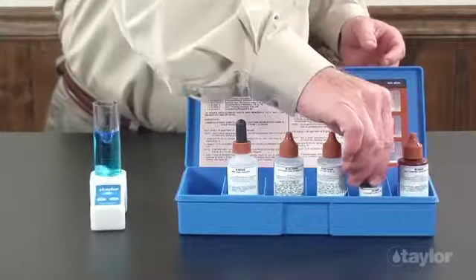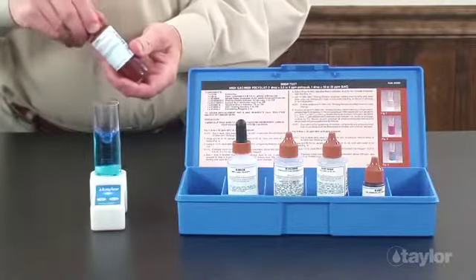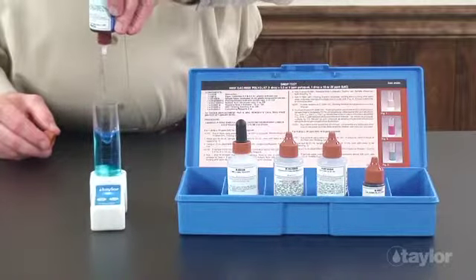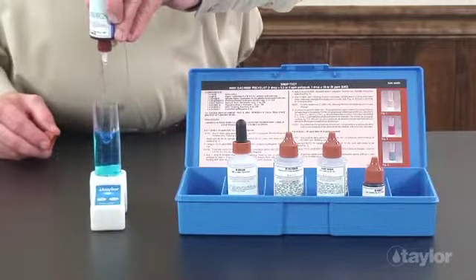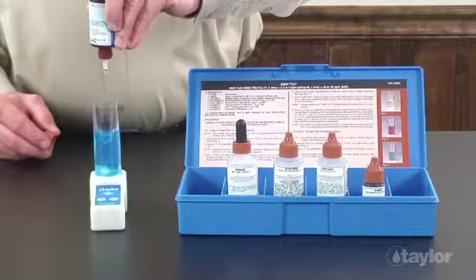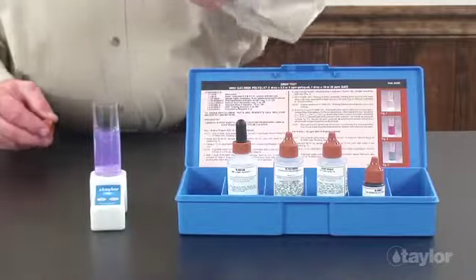Taylor's test method for QAC can be categorized as a titration. Titrations, or drop tests, require no color matching. They are performed by dispensing a standardized reagent from a dropper bottle into a measured volume of treated sample water until a permanent color change indicates the endpoint of the chemical reaction.